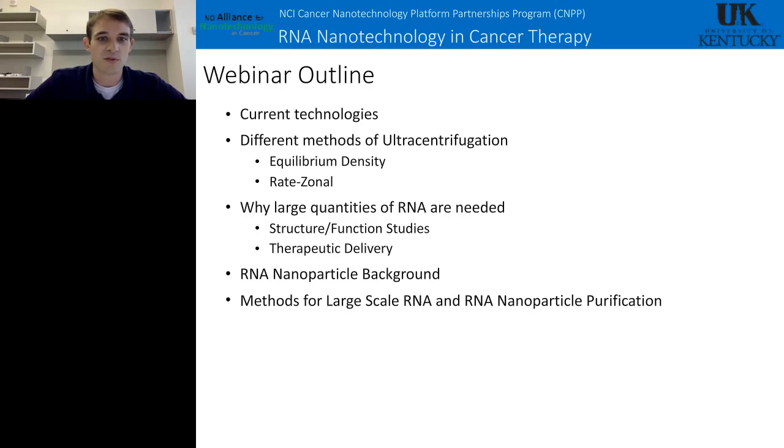Then I'll talk a little bit about the different methods of ultracentrifugation. And then I will go into some RNA nanoparticle background, which is mostly my expertise, so I can give you some rationale on why we need these methods for RNA purification and for nanoparticle purification. And then finally, I'll move on to some methods and give you an example of purifying some RNA after in vitro transcription, and then purifying a nanoparticle after assembling that nanoparticle.